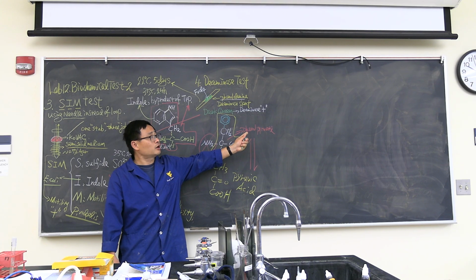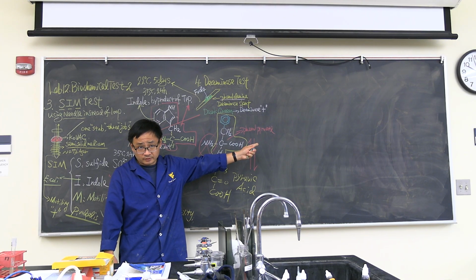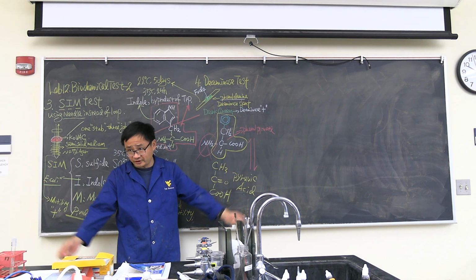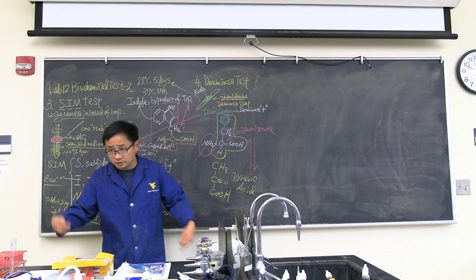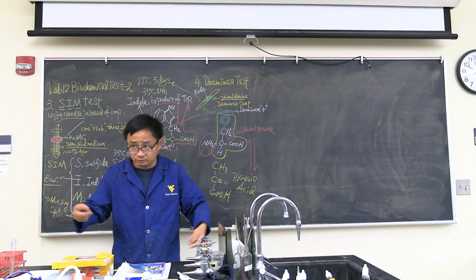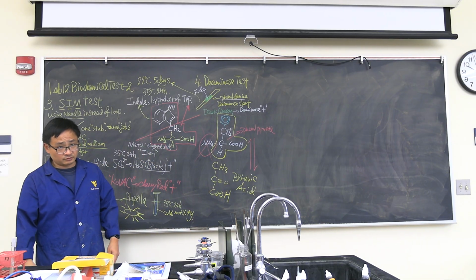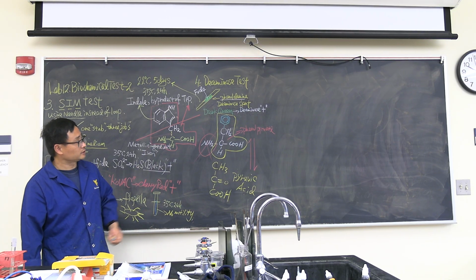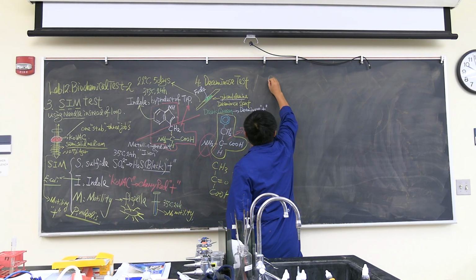It can directly jump in the next biochemical reaction. What's that? Citric acid cycle. But of course, it's a modified citric acid cycle. Is that right? Because pyruvic acid goes to citric acid cycle. And this phenylpyruvate, very similar, and the phenyl group goes to modified citric acid cycle. And bacteria can survive. So that's why they do deaminase. Okay? So that's called deaminase test. That is number 4.